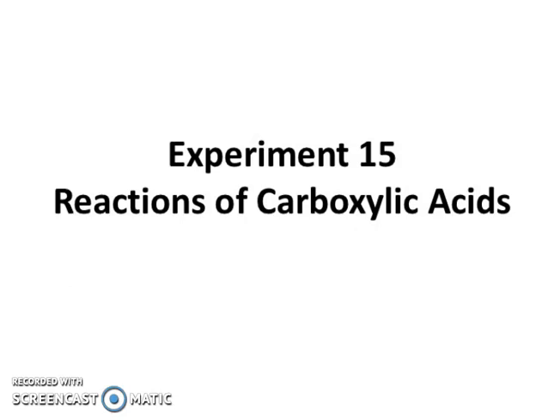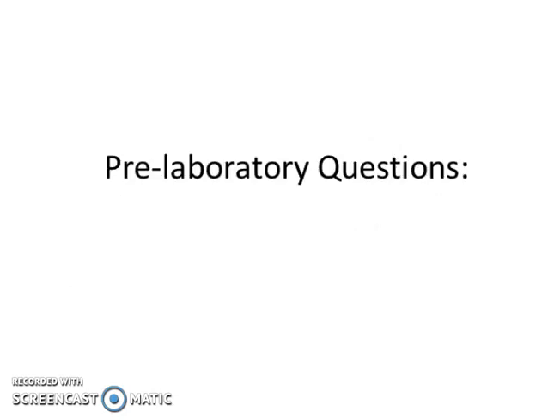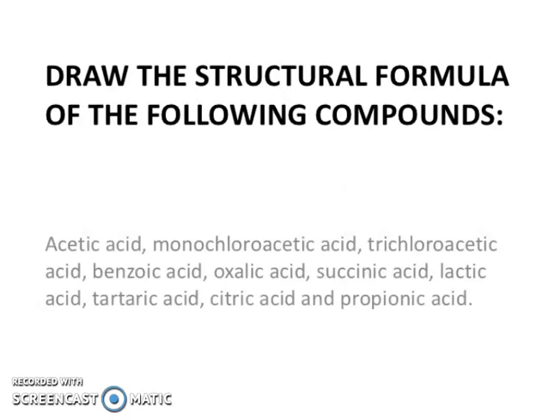Today in this video, I am going to show you reactions of carboxylic acids. So, pre-laboratory questions, because you should know some questions before the lab.